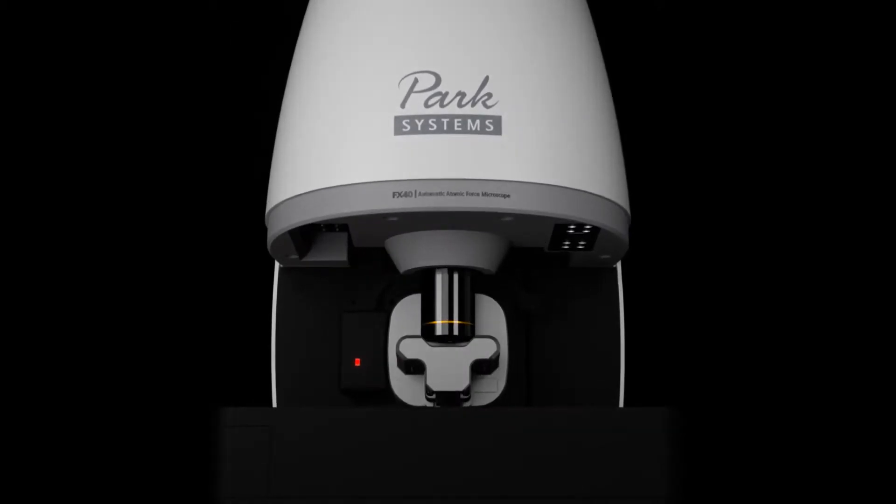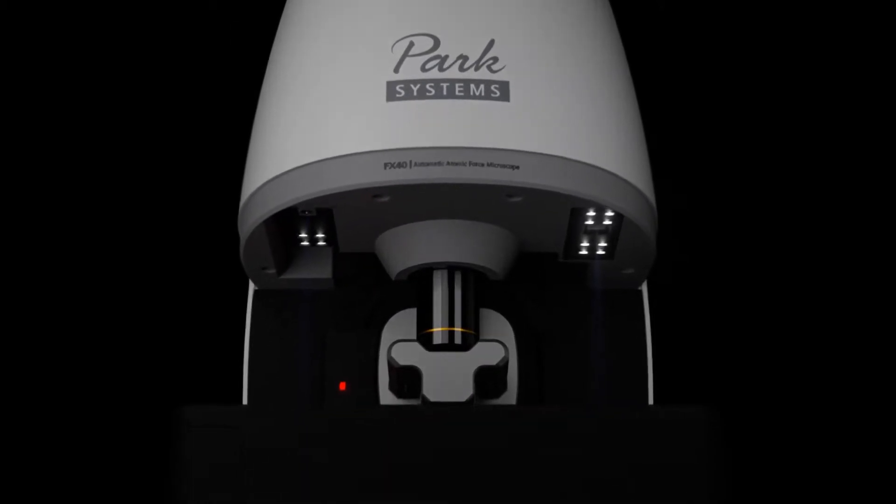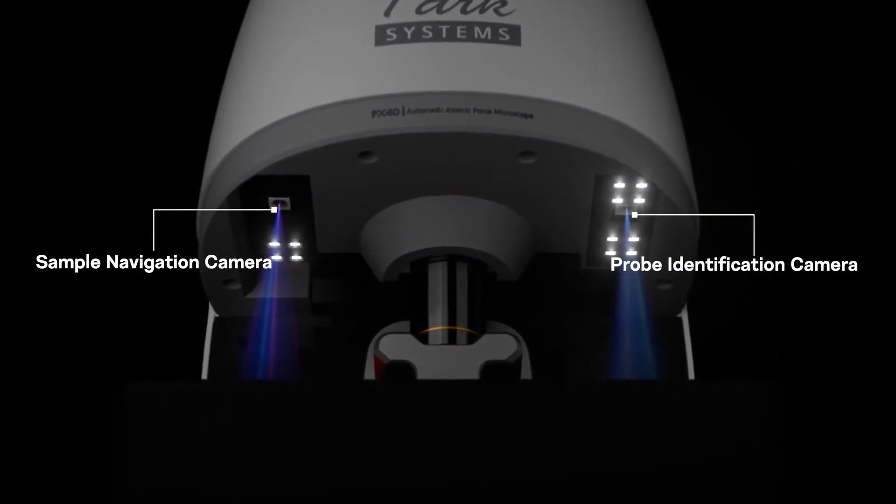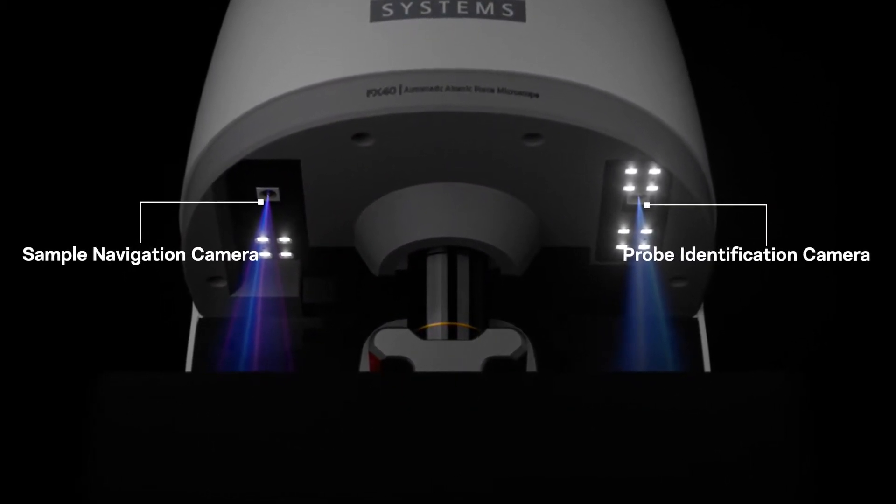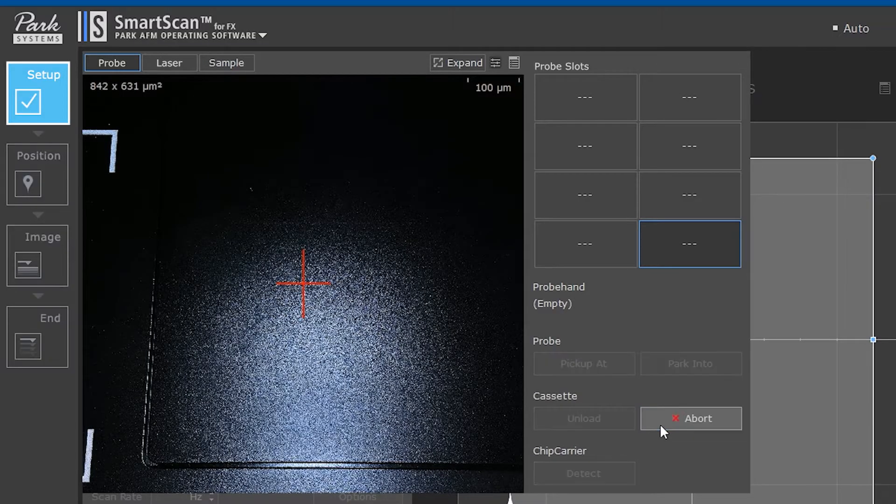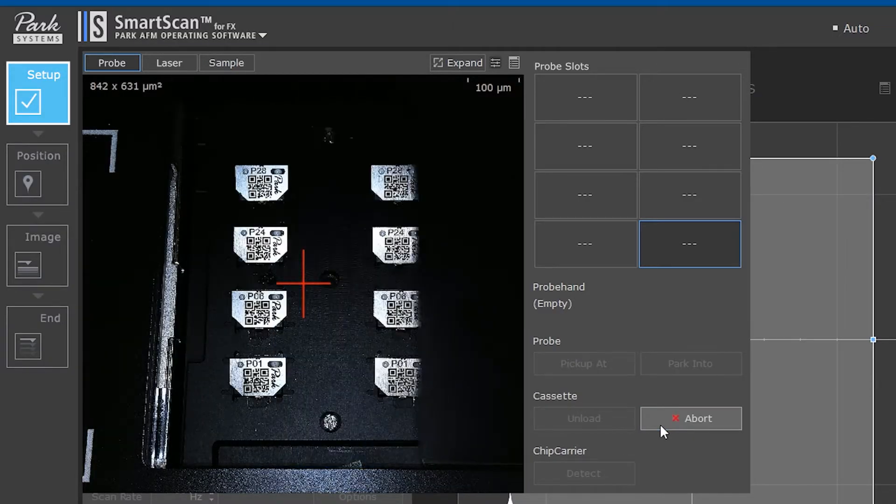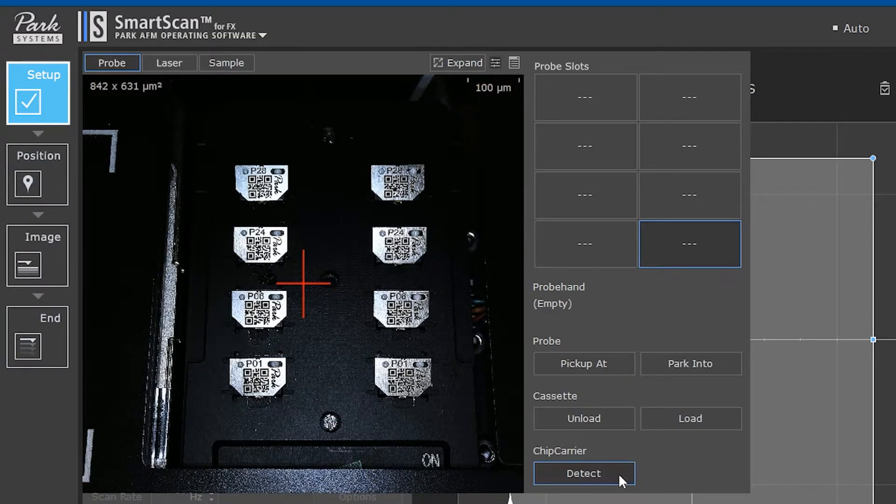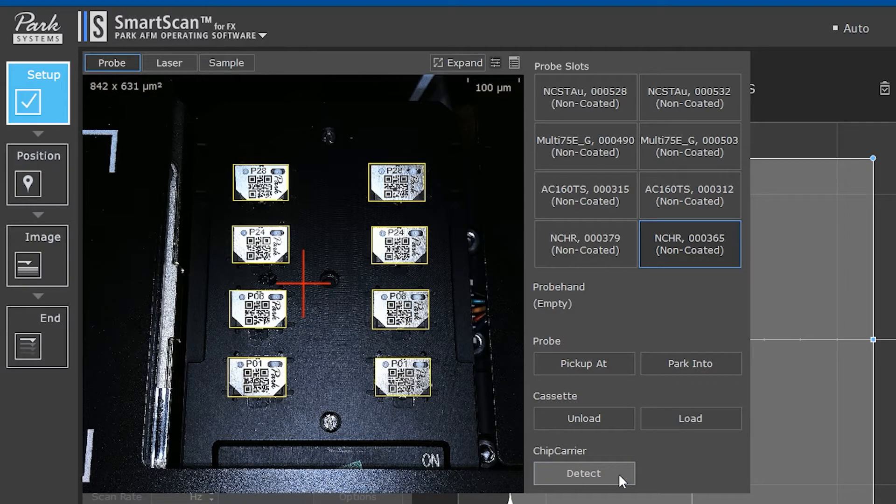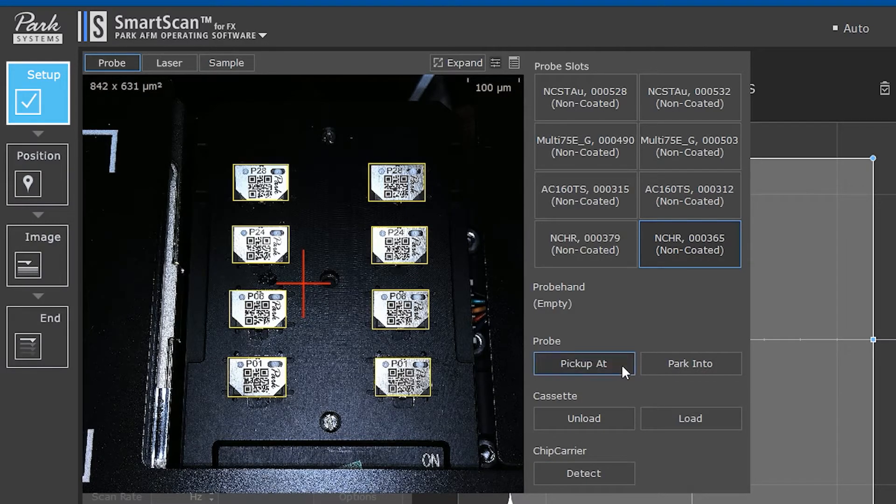There are two cameras where one is above the probe loading slots and the other above the samples. SmartScan will check whether the chip carriers are properly loaded and read the QR codes on the chip carriers.